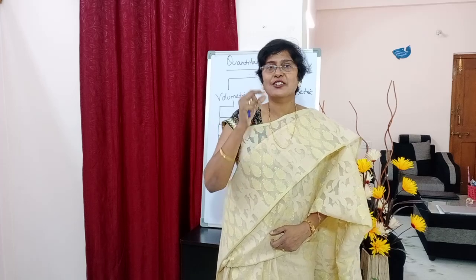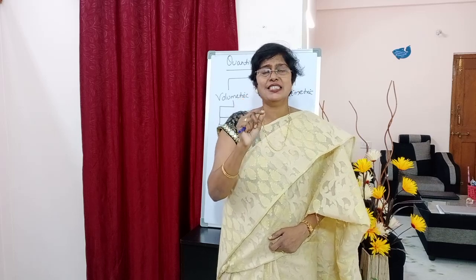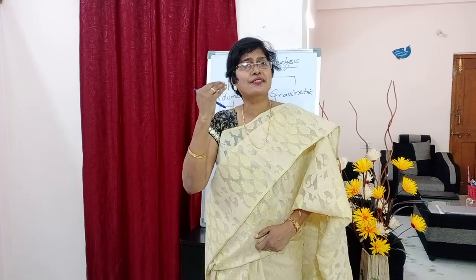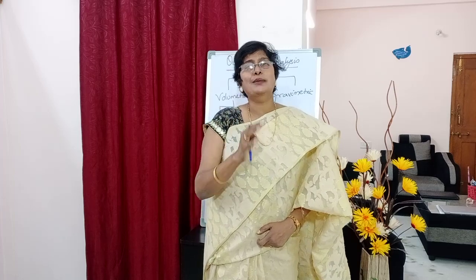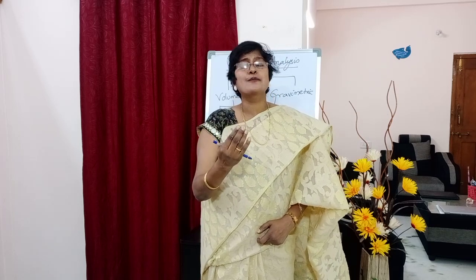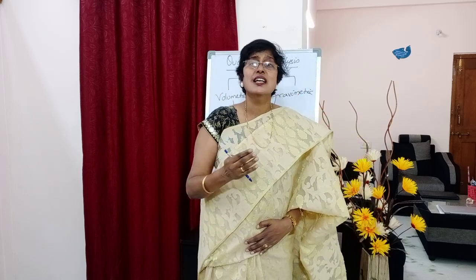Okay, students, right? So the practical that we are going to do in second year is called quantitative analysis, which is nothing but determination of the amount of the constituents present in the given solution. Okay. Now this quantitative analysis can be divided into how many types? Two types. What are they? Volumetric analysis and gravimetric analysis. Okay. So first we will be doing volumetric analysis. At the end of the year we will be showing you the gravimetric analysis. Okay. So both come under quantitative analysis only.